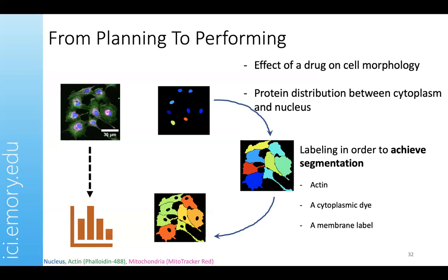Now, having said that, we can use some of the deep learning tools, right? Because you will be like, oh, well, you just showed that data from liver from Nikita Gupta's lab where you told us that there was no label, but some of the deep learning tools were still able to identify the cells. Well, that's true, but we want to make life of these tools easy.